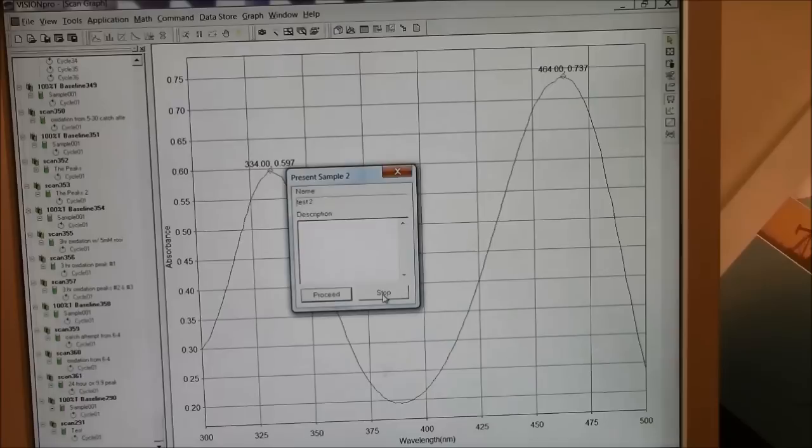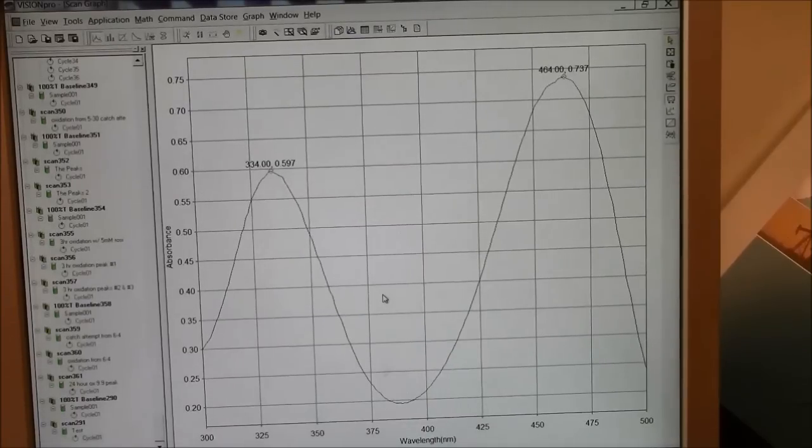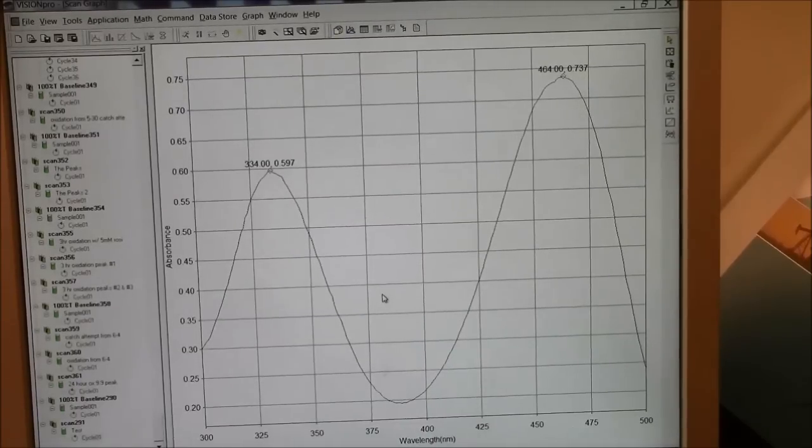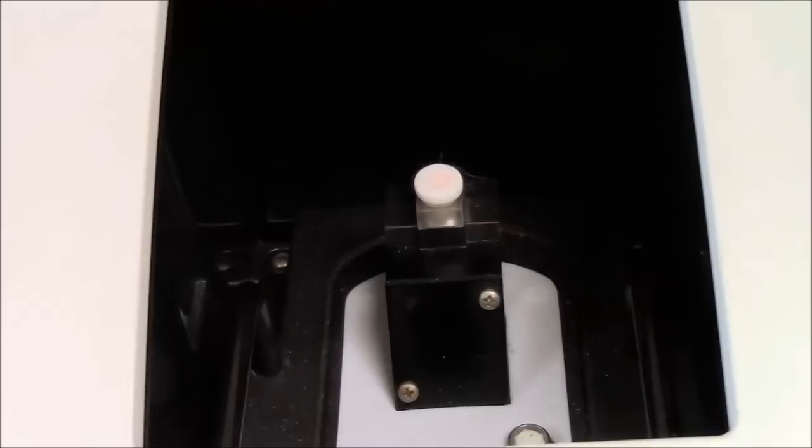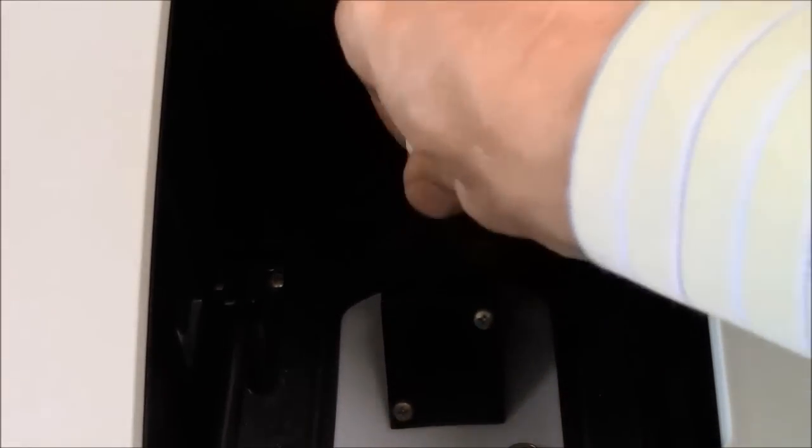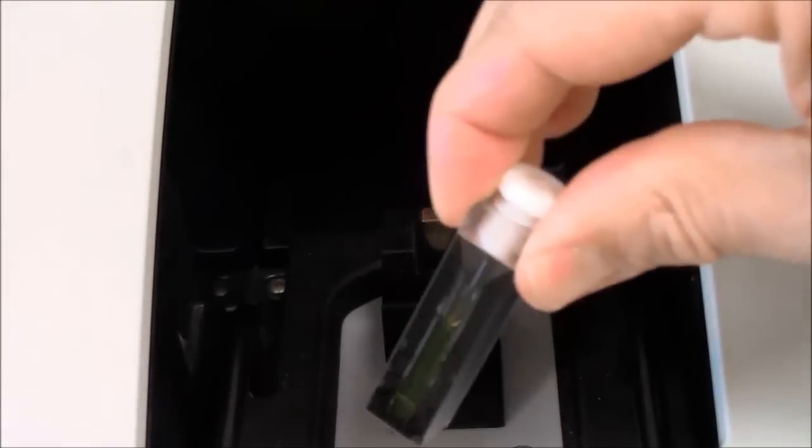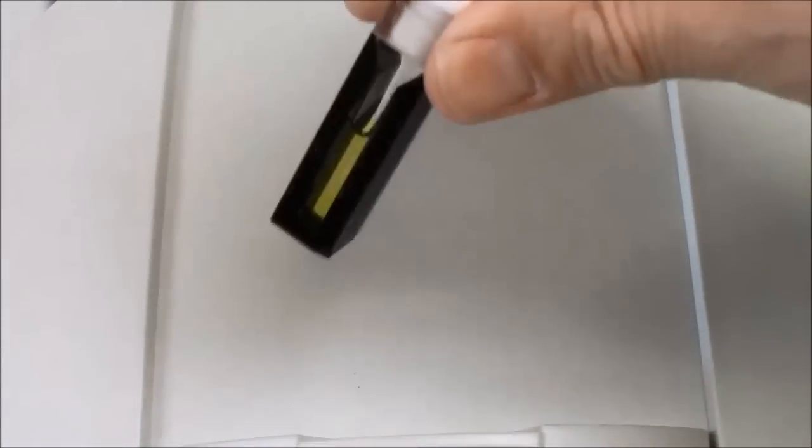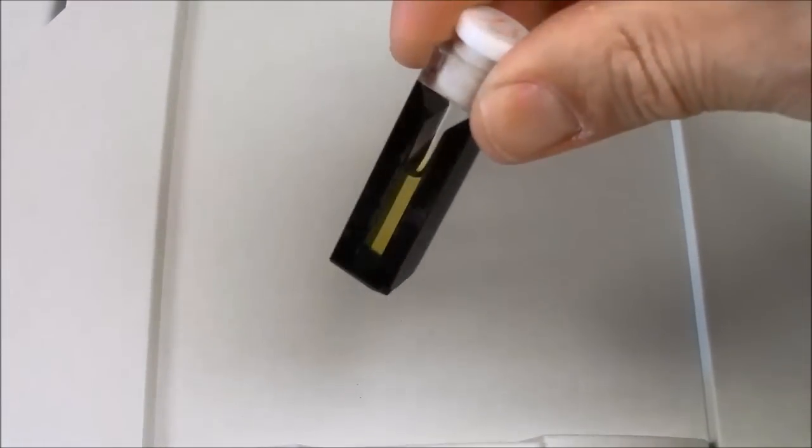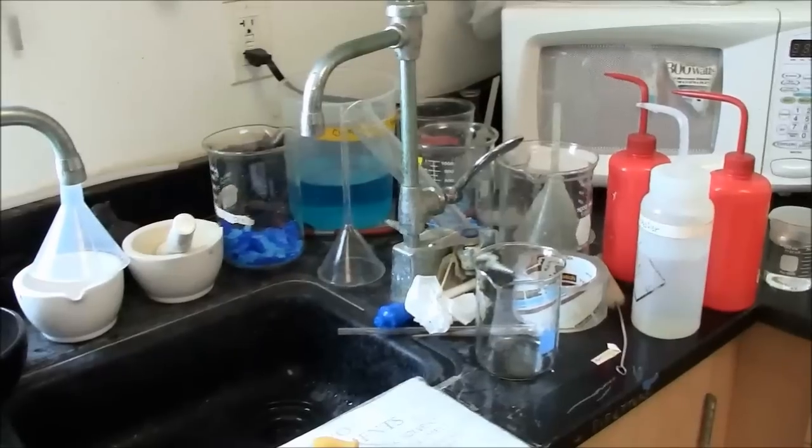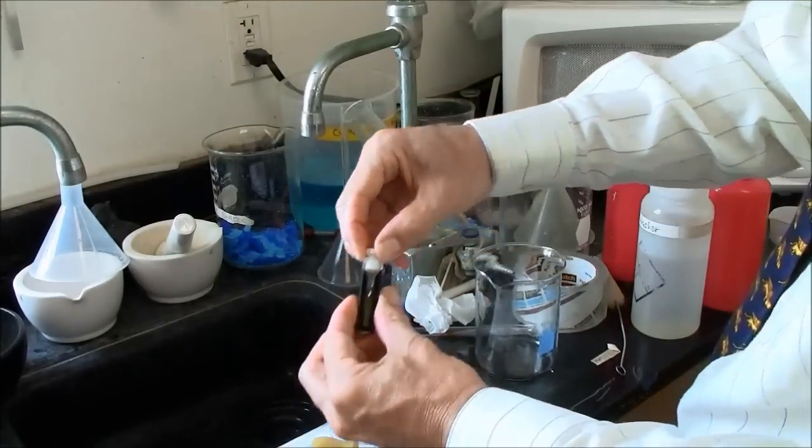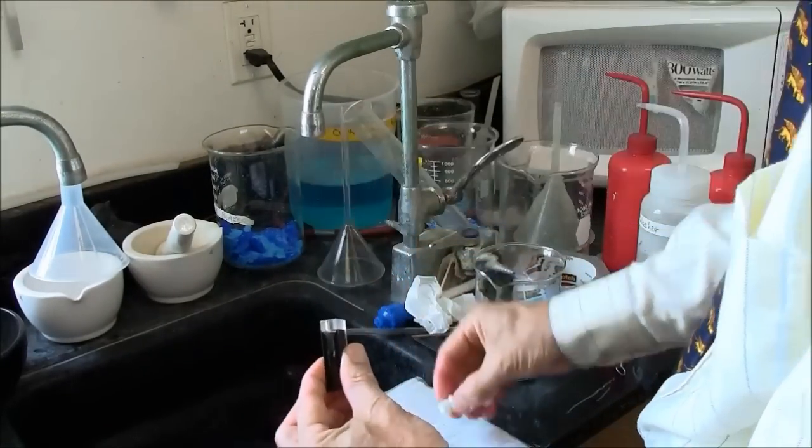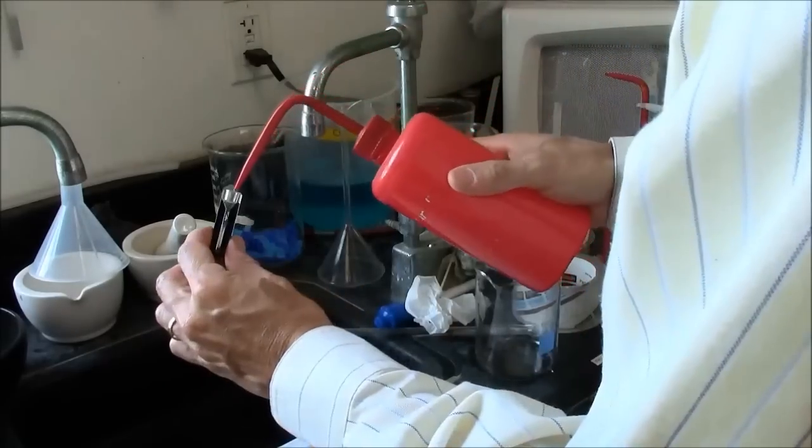All right. So in this case, I'm pressing stop. And I'm done. I have a spectrum. When I'm done, I remove the cuvette from the machine. I need to rinse the cuvette thoroughly so that I will get a clean spectrum next time. Since I used ethanol as my solvent here, it is appropriate that I wash the cuvette with ethanol.